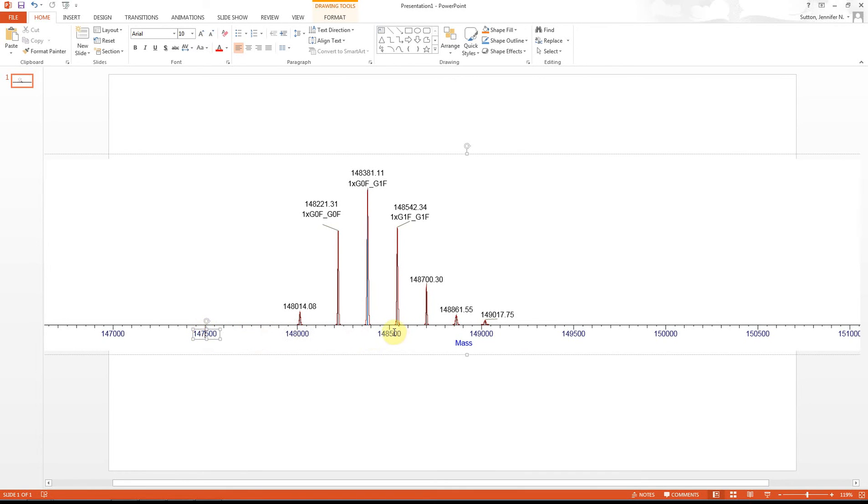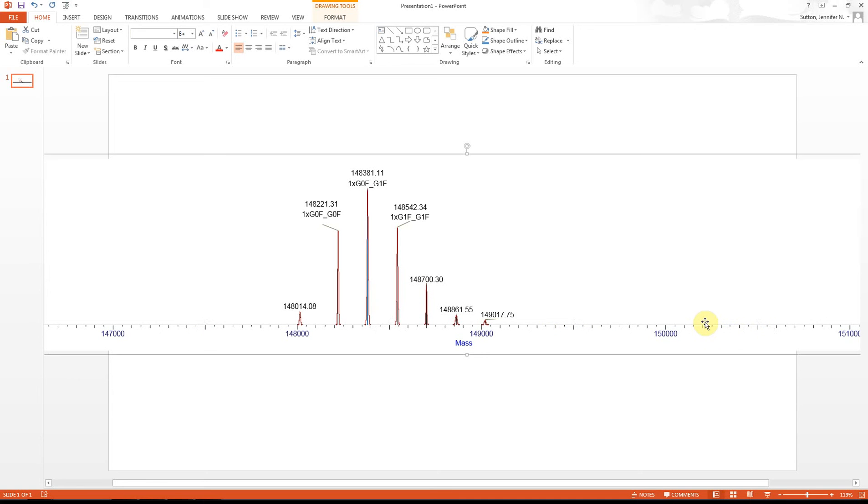whichever one you'd like. Every other one. If you hold Shift, you can select more than one at a time. Select them all, then hit Delete.